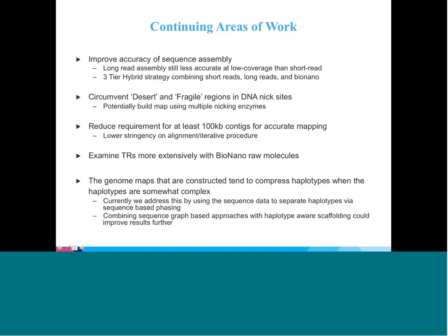One thing we didn't do systematically was examine TRs, but clearly, as Bobby showed, they're very powerful, and we can really resolve them. We have a couple of interesting cases that we resolved exclusively with the BioNano raw molecules. I think this is really an exciting area because these are the regions that no one's really looking at in the genome.